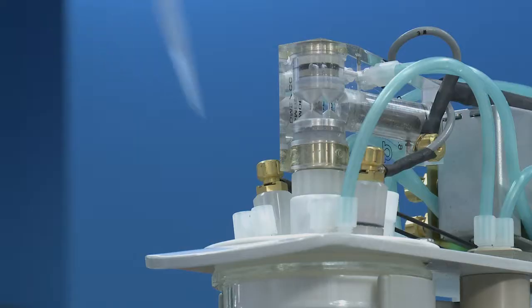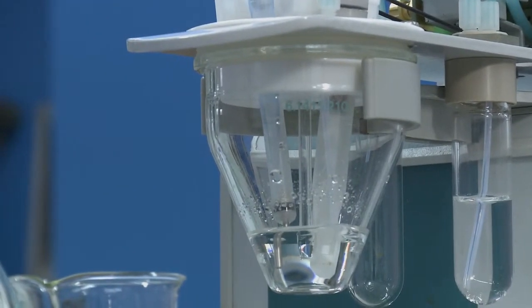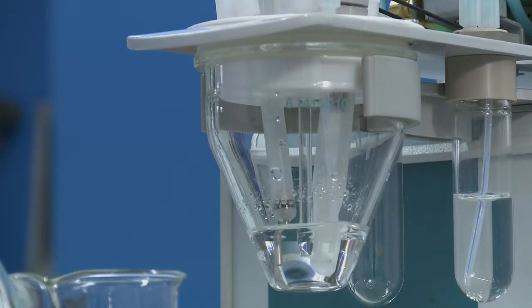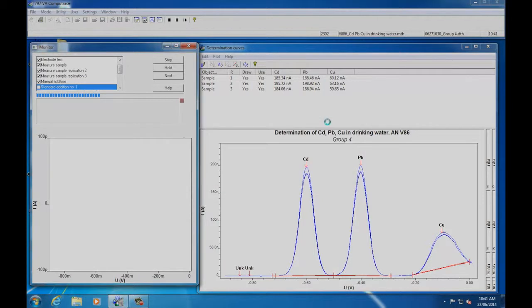Then it will be injected through this port covered by this Teflon plug. Remove the plug, and you want to ensure that you inject the fluid directly into the cell without hitting the electrode or the glass wall. Replace the Teflon plug and click ok to continue.